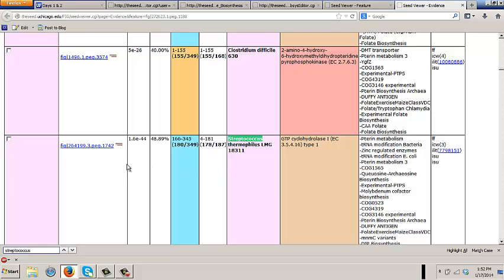It's a spectrum. Now, to make the coloring even more complicated. These 4 columns all try to describe the actual alignment: how good, 2 columns, and then what area of the query and the target are involved. And they have the coloring to convey that. This column with the names of organisms is a completely separate coloring system, and that tells you the kingdom.